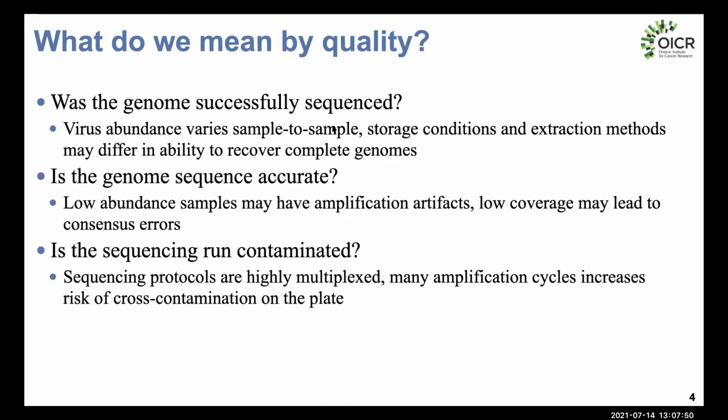And finally, we want to check for technical issues that went on during the sequencing run. So we want to check for contamination. All of the sequencing protocols are highly multiplexed. You sequence dozens, if not hundreds of samples simultaneously, typically in plate format. And you can have cross-contamination between different wells of your plate.